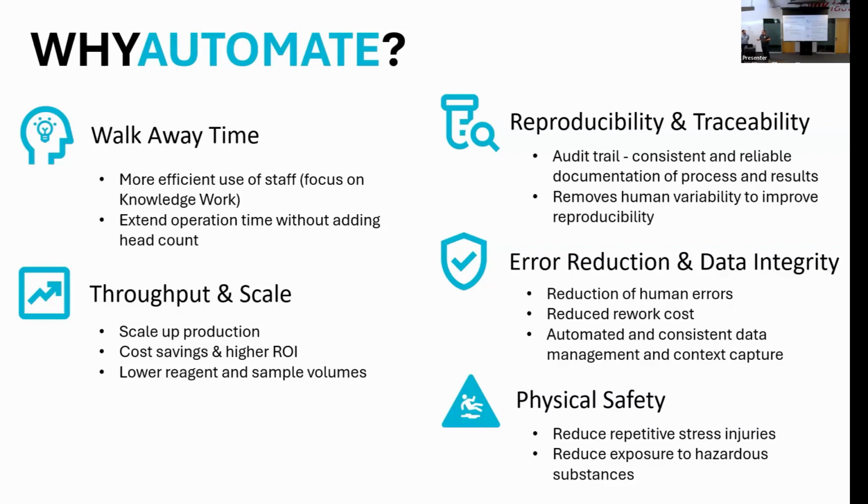And finally, physical safety, right? There are repetitive stress disorders that you can get from working on these very repetitive jobs. And again, the use of hazardous material and being able to really separate people from that.